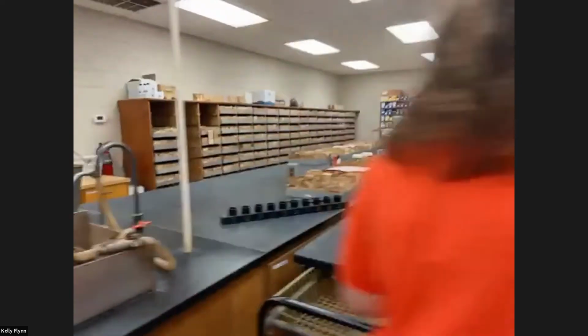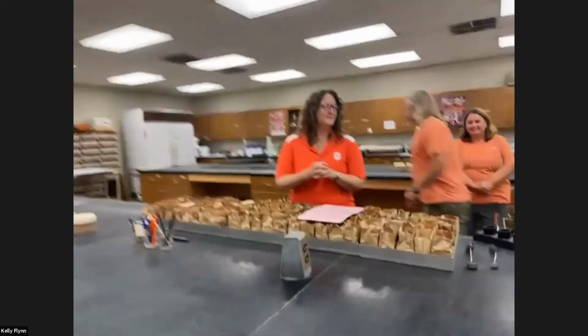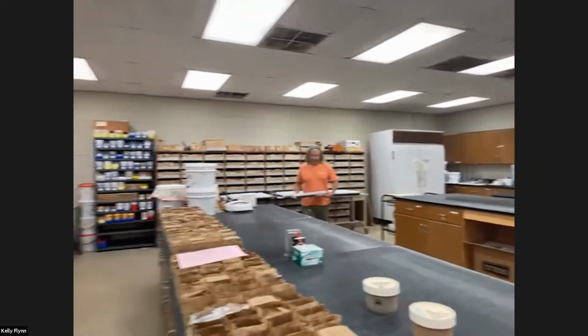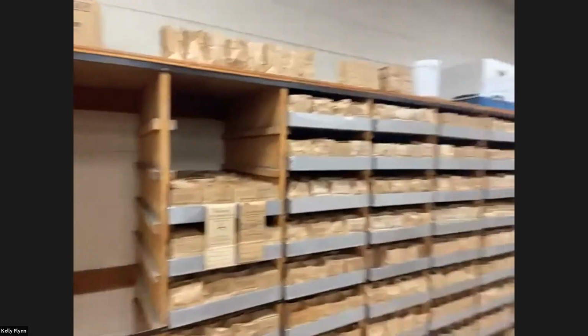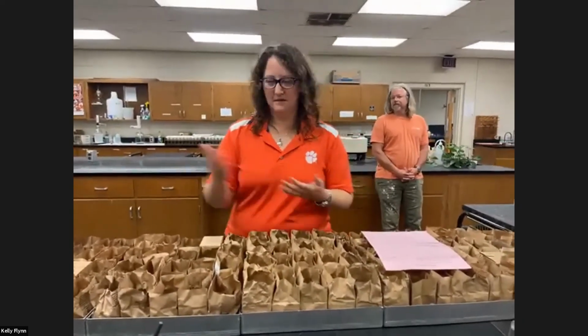And I'm gonna do this part. So in this particular room, which if Kelly were to pan out, maybe show you all around, there's a lot of soil samples in this room that we have already analyzed. So I think of this as our soil library. So if a customer wants us to recheck or decides they want another test, we keep soil samples around just to try to accommodate any extra requests.